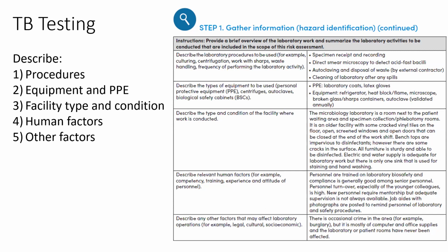And next, they describe the type and condition of this facility. We didn't get into a lot of detail about that, but here they describe their laboratory in a room next to a patient waiting area and a specimen collection phlebotomy room. So it seems to be kind of wedged in between some areas where contamination could be a problem. It's an older facility with some cracked vinyl tiles on the floor, screened windows. So there's no protection from the elements during the day, and open doors. They do close them at night.